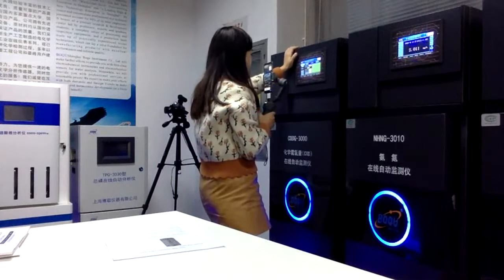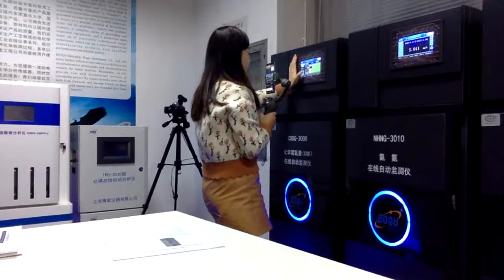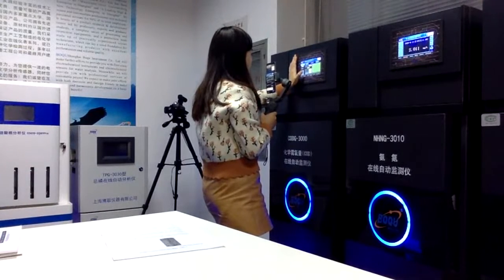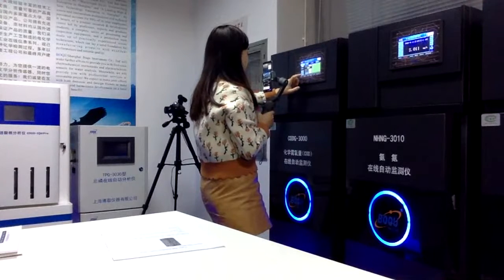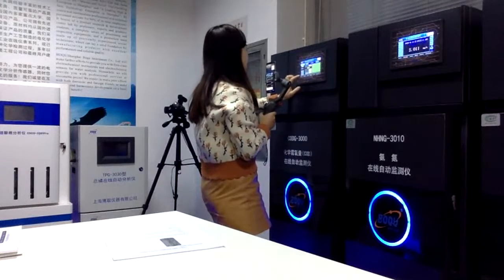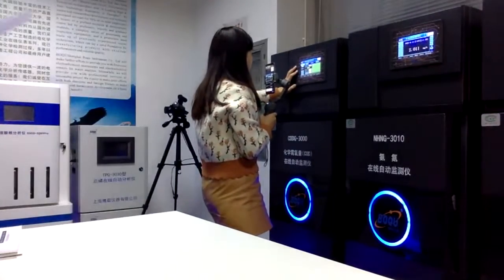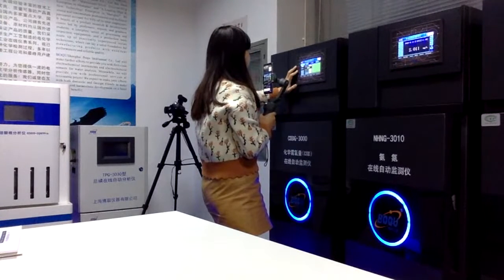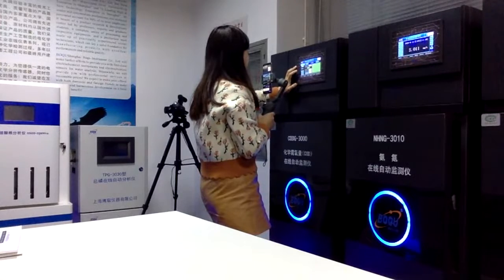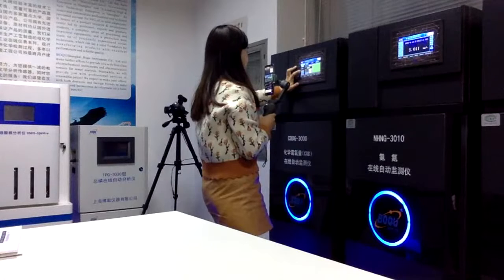And also we have the calibration time and calibration period time, which you need to calibrate. And then also there is calibrate instantly, so that means you can click this button and then you can calibrate immediately. And also we have an instant calibrate directly.